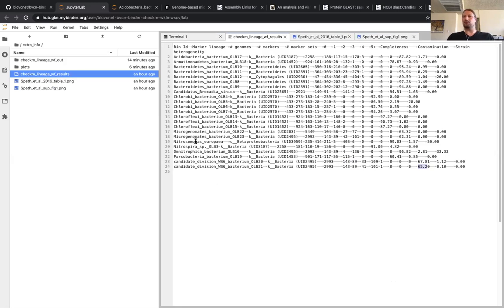All right, I will leave it at that. Feel free to contact me if there's any questions about the binder or about running this. And yeah, happy bin evaluating.